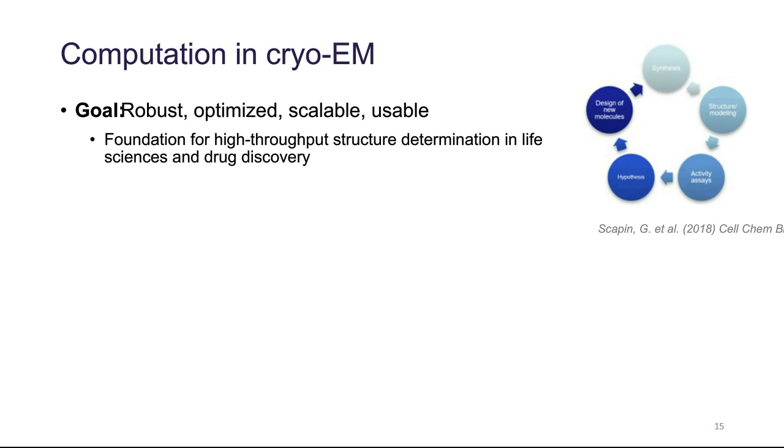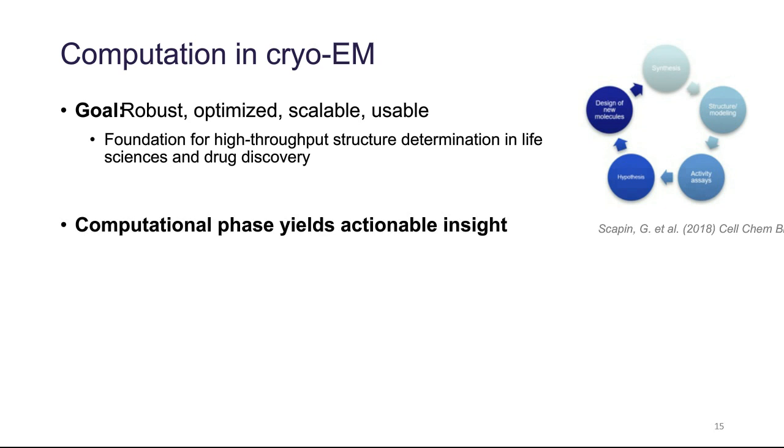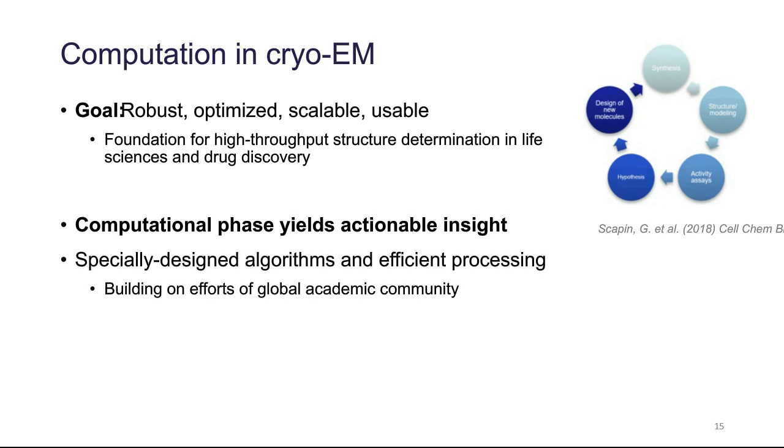The computational phase of CryoEM is the one that converts reams of 2D image data into actionable insight, as Jakob mentioned, in the form of 3D structures. It is where all the details and challenges from sample preparation and imaging must be dealt with, and as such, the tools, algorithms, and software used must be able to deal with a vast array of different sample conditions, imaging conditions, molecular shapes and sizes, heterogeneity, disorder, etc., that are present in real valuable targets. The field of CryoEM has been fortunate to have many dedicated people working on it for decades to bring us to the point we are at today.